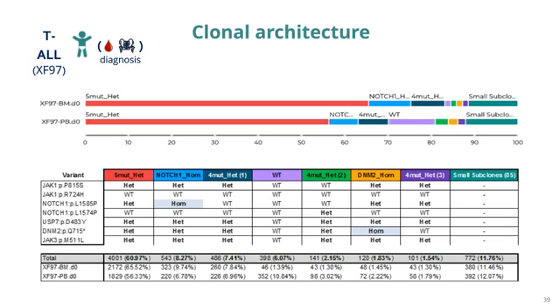This is really valuable information and can be really interesting, but we also have to be cautious. We have to be careful interpreting this data, because as I pointed out before, we are aware of the allelic dropout rates. So those clones can contain cells that are the result of allelic dropout and not truly homozygous. It's very difficult to distinguish truly homozygous from allelic dropout, but one thing we can do is check the metrics of each of the variants.